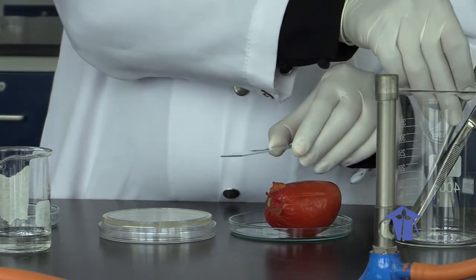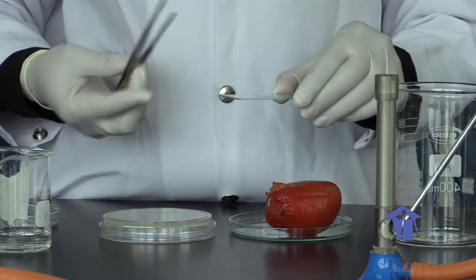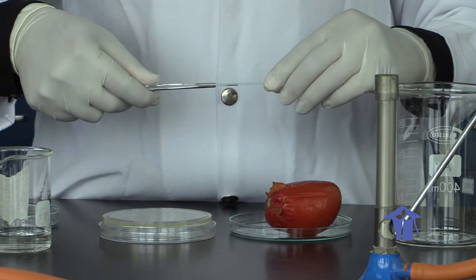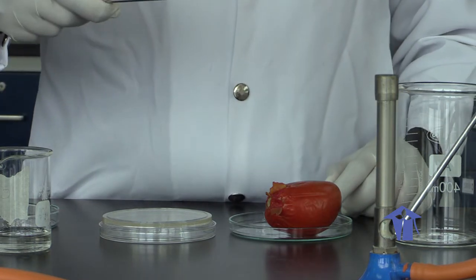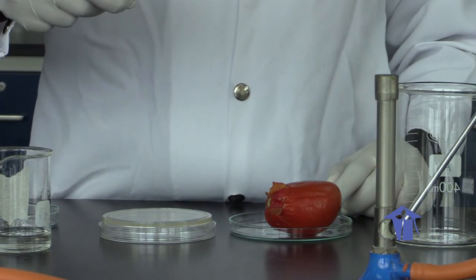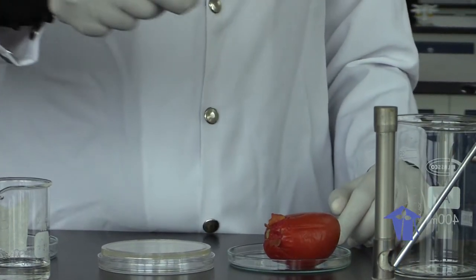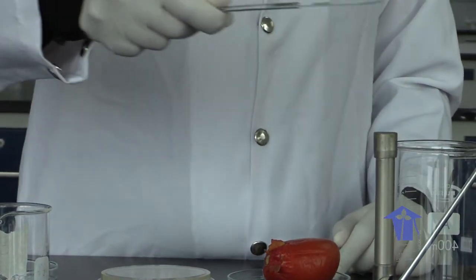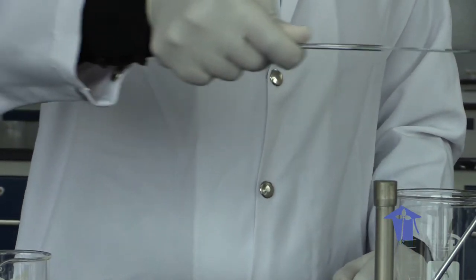And we'll have to heat fix this specimen before we complete our Gram stain. So we can use our forceps there to hold our slide. Now remember, when you are heat fixing, you do not hold your sample directly over the flame. You can move it across the flame in intervals, and you're doing this so that you do not kill your specimen.